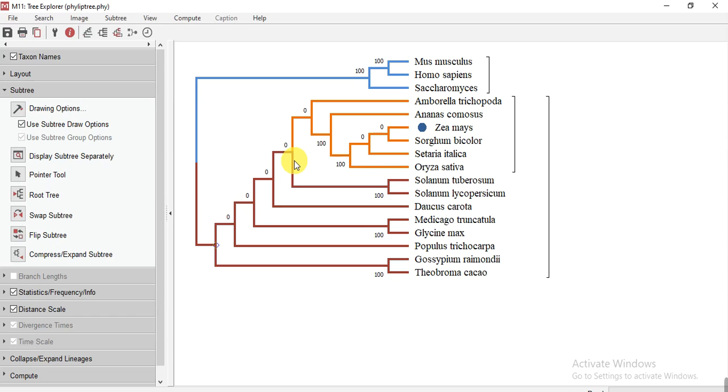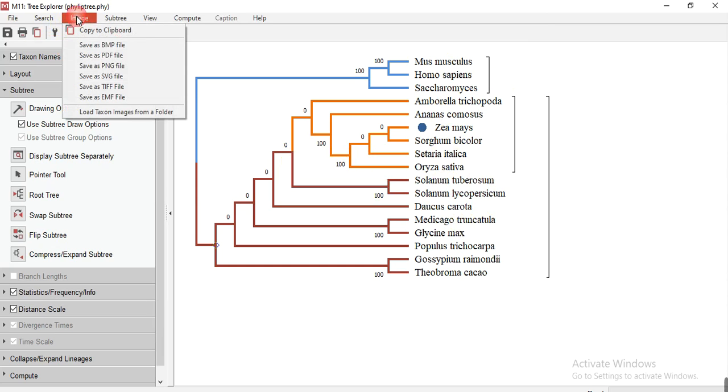And then you can save it. Go to image and then save in which form, PDF or TIFF file, and then you can use it. So in this way you can make or construct the taxonomy tree or species tree or evolutionary tree to check the relationship among various species with your studied plant.